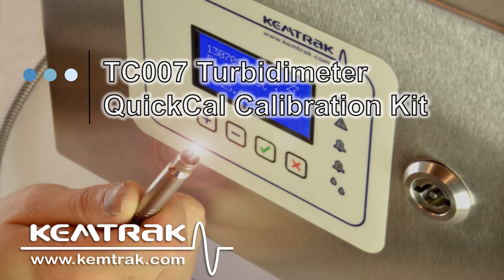This video will show you how to use a QuickCal calibration kit to calibrate a Kemtrak TC007 turbidity meter.